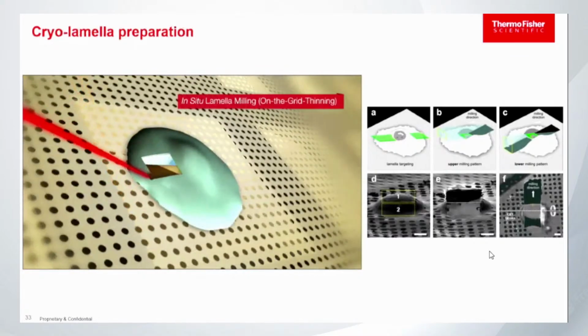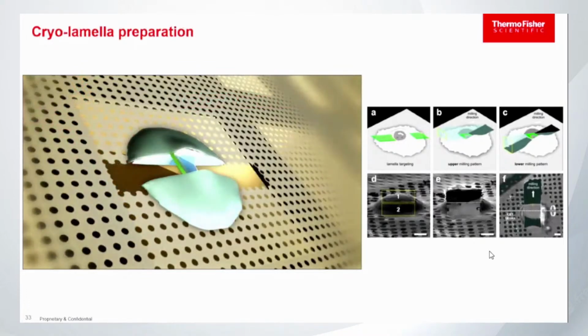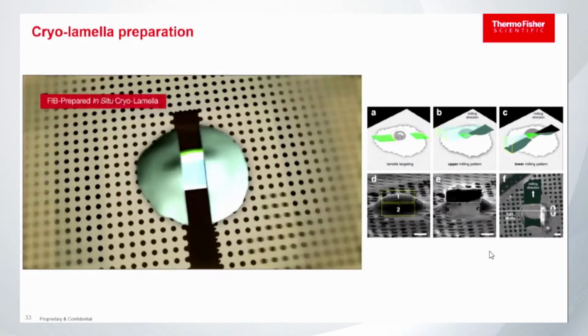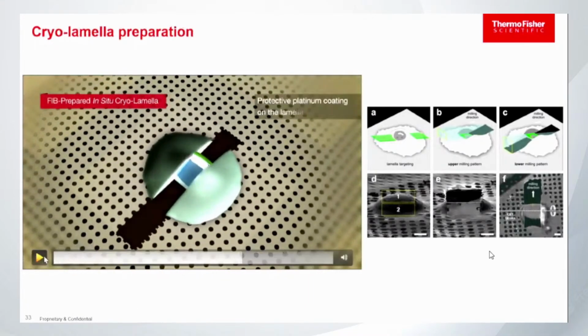Again, with the focused ion beam, you will mill all the material away. You will create the lamella. And that lamella has the area of interest because, and I will stop the video here, in this machine as well, we have an integrated fluorescence light microscope. That's super cool, because before we didn't even have the integrated fluorescence light microscope. So what does that mean? You have your Leica system. Usually people use the Leica system and they are very good.